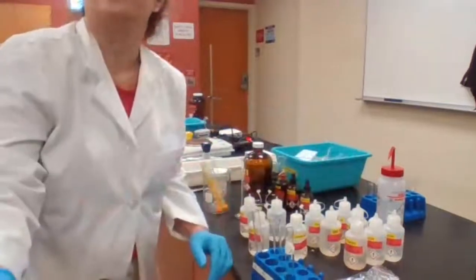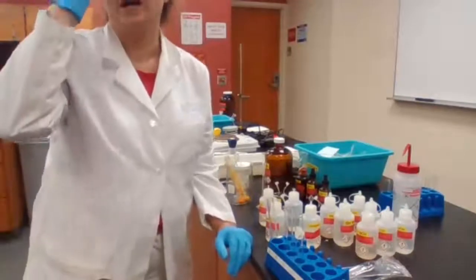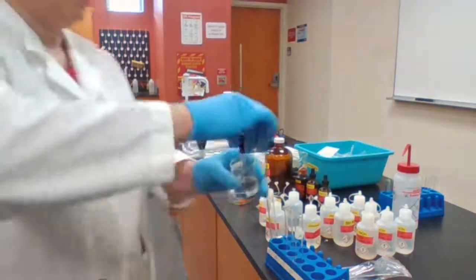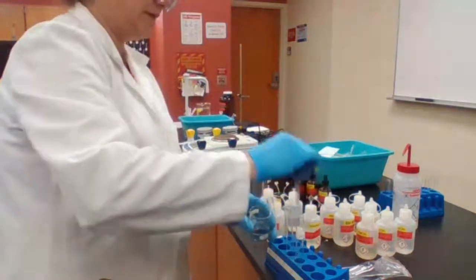And next step, we are going to add 2 milliliters of dioxane to each. Okay. 2 milliliters of dioxane to each one.